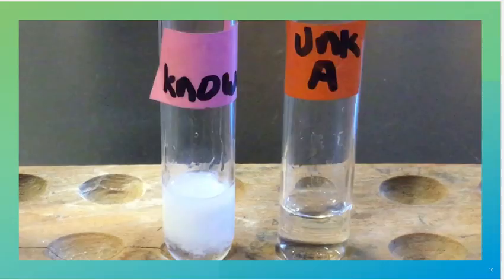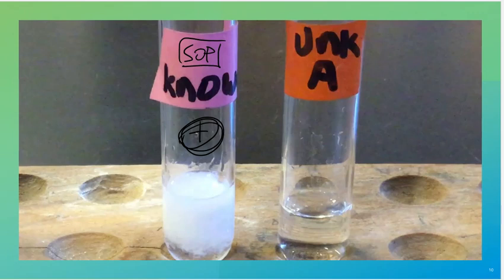All right, here's just another example. Here's like a known, right? And then here's an unknown. So here is the idea that we know that this has chloride, and we know that when we add the reagent, this will become positive because we know that chloride is present. This is not uncommon. However, the SOPs will include this information. This is not going to be found in the monograph most of the time. So the monograph is really just going to focus on the test material and nothing more.